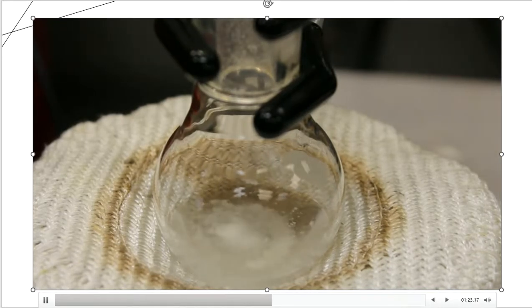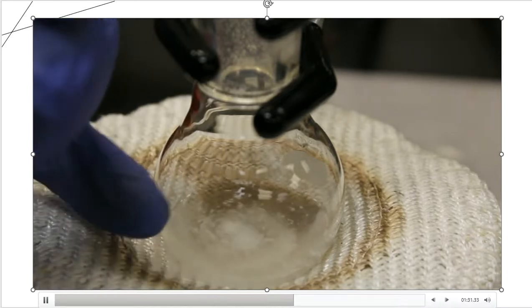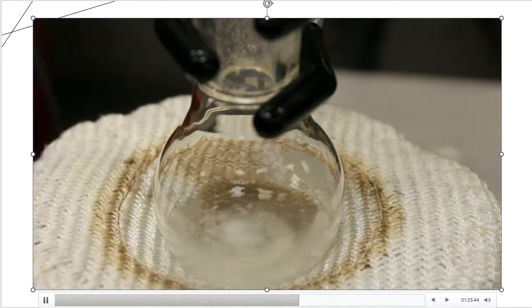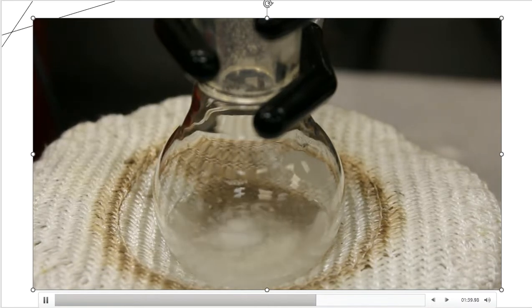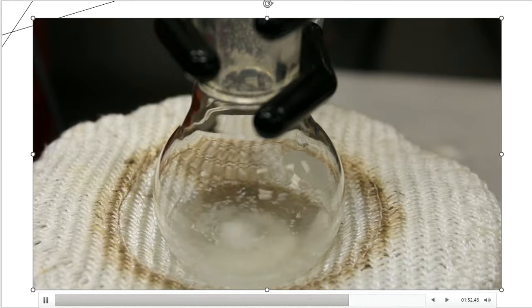All right, so I'm going to continue to add the aluminum chloride just like this. I'm starting to see the flask is getting a little cloudy. It's probably a good sign that it's creating some heat for me, and it is. The crystals are starting to dissolve more and more, and this is pretty normal. So the directions actually tell me if I see a spike in temperature or if this stuff begins to kind of start boiling on its own, to have some cold water that's ready and dunk that beaker down into some cold water.